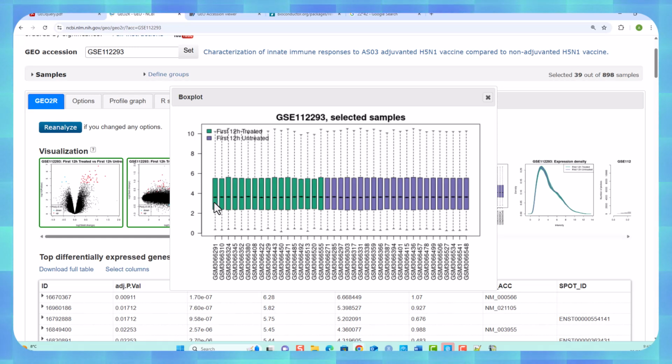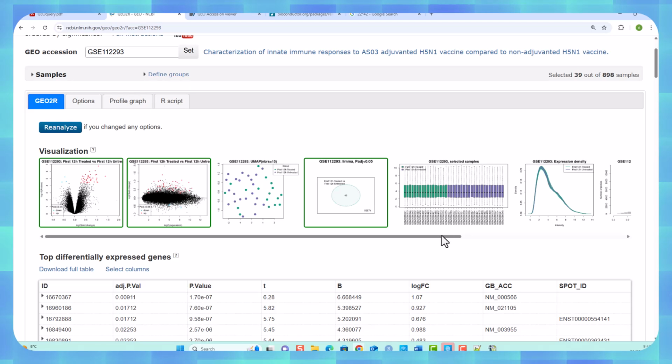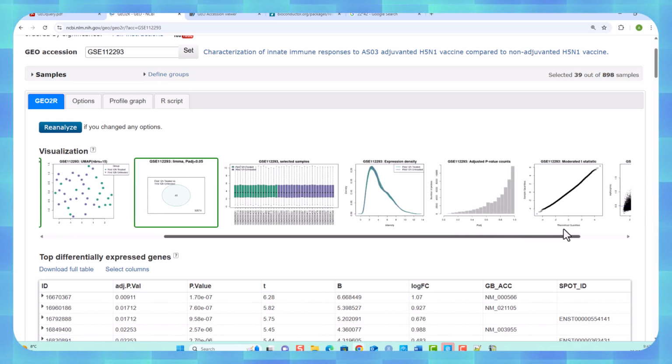So this process is called normalization, and it involves you getting the box plot of the amount of expression and making sure that the medians and the interquartile ranges pretty much align with each other. And you do this just by mathematical fiddling around to make sure that they're all stacked up over each other. So it's well normalized and the data is pretty reliable.